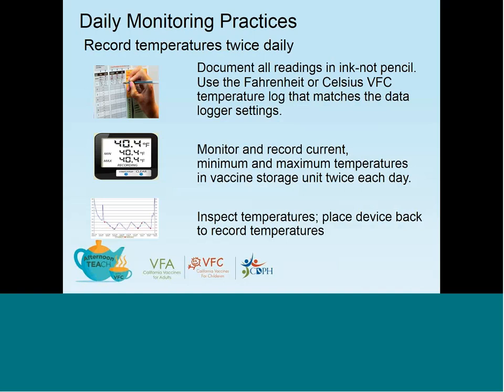Ensure vaccine unit temperatures are recorded on VFC temperature logs that match the data logger settings. Monitor and record current, minimum, and maximum temperatures in vaccine storage units twice each day. Inspect temperatures, then place the device back to recording temperatures.